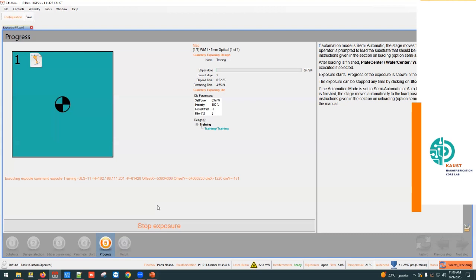So for now, it's me or Manuel, the second owner of the tool, who are allowed to change the chuck in case a user wants to use the automatic loading, and always when this person is trained, because for now I haven't given the training for the automatic programming of the tool or using the handler.